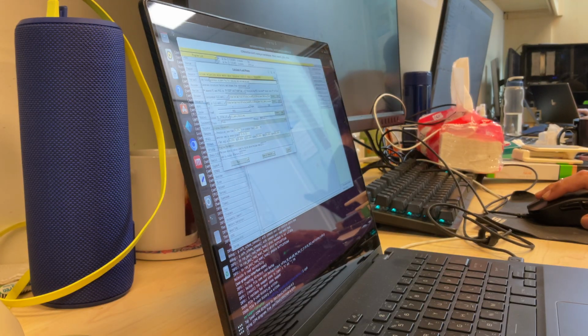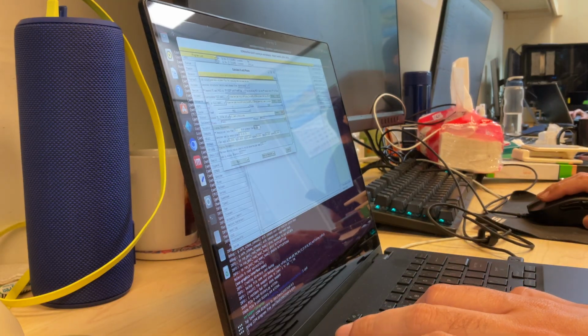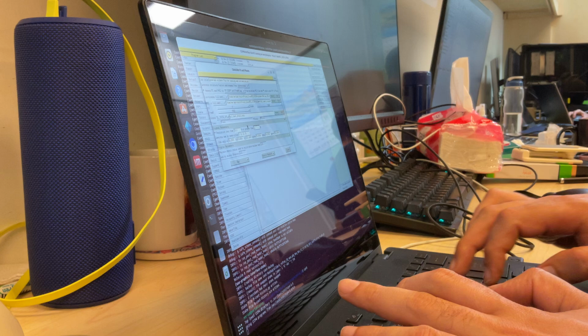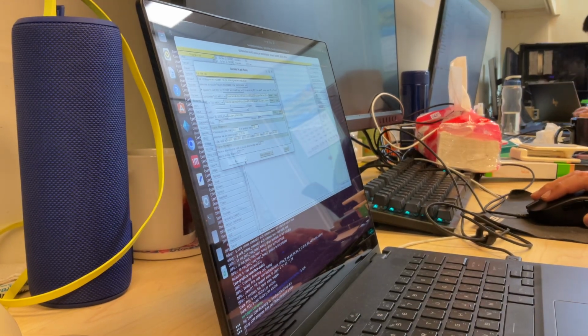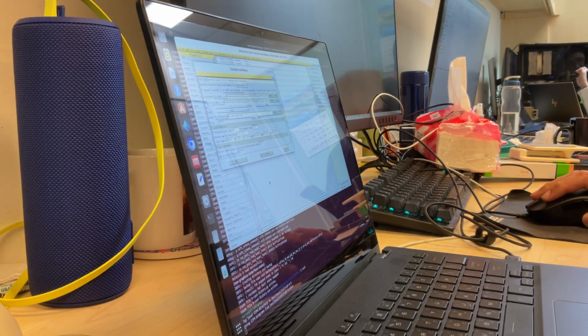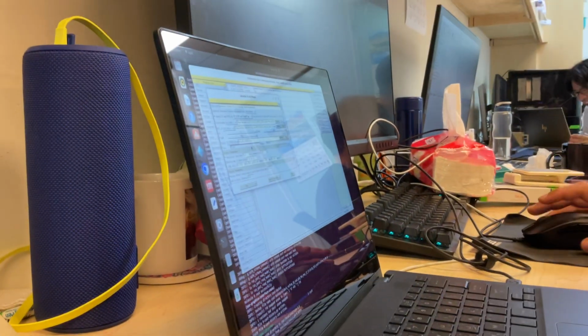And now the resolution, we're gonna cut it out at, for example, 35 angstroms to what? 1.47. 1.47. Okay. And we just run it. Let's do one thing. FCalc. Okay, that's fine.